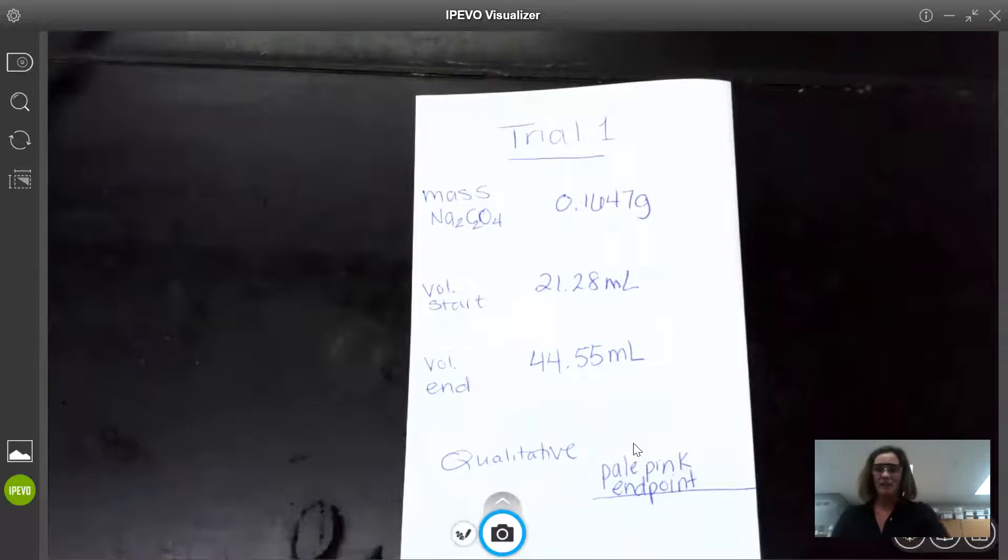So at this point, a student would go on to collect trial two and if those first two trials weren't in good agreement, they would go on to titrate trial three. So right now I'm going to provide you with some data from trial two so that you can proceed with calculations three and four in the lab.